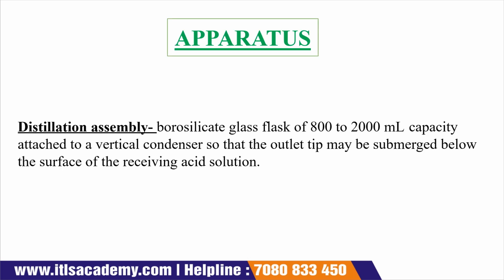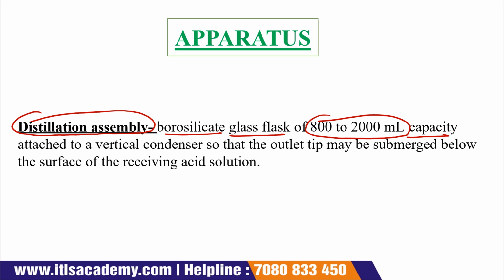Now the next one is the apparatus used for this experiment. Okay, so we require a distillation assembly. Now this distillation assembly is associated with a borosilicate glass flask of 800 to 2000 ml capacity. First of all we require a distillation assembly.